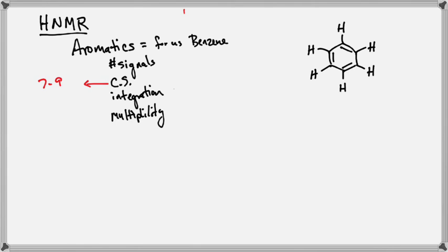And seeing that should be a hooray moment, because if you have an aromatic ring, that's 6 carbons that you've already locked into position. That's a huge chunk of a molecule. So seeing that show up usually is very, very beneficial. That locks in a lot of atoms very quickly.